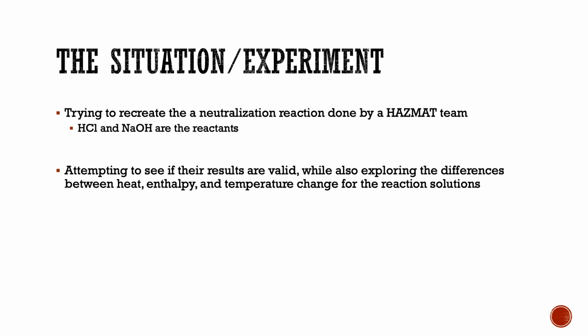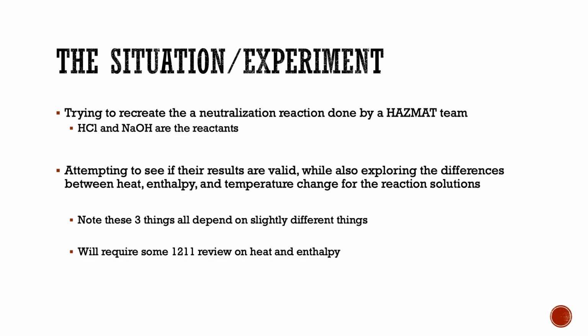They are all related to one another, but they are not the same thing. They each depend on slightly different things. That's one of the big takeaways we want you to have coming out of this lab: to understand how those things are related, how they are different, and what things impact one or the other. Like I said, they will all be affected a little bit differently by different things.